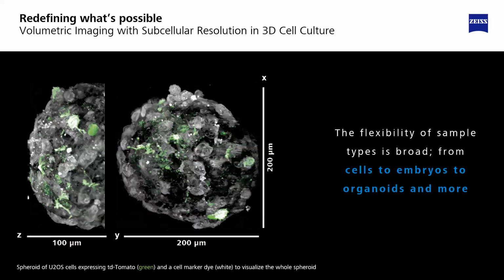So lattice light sheet is not just beneficial for imaging flatter, more two-dimensional cells, but it's also really great at imaging in three dimensions and catching really high-resolution volumes. So here we're looking at a three-dimensional cell culture, or an organoid. And this is a really great fit because if you've ever imaged three-dimensional samples or done volumetric imaging on another microscope, what you usually see is a really elongated projection in the Z dimension after you catch your Z stack. This is usually really readily apparent when you look at your cross section in an XZ projection.